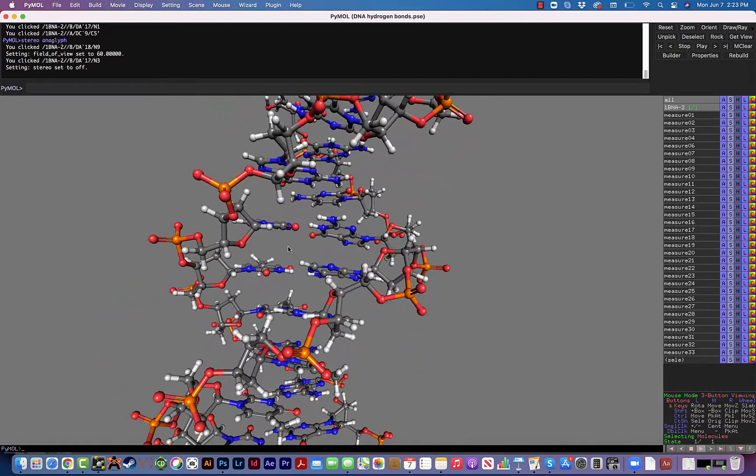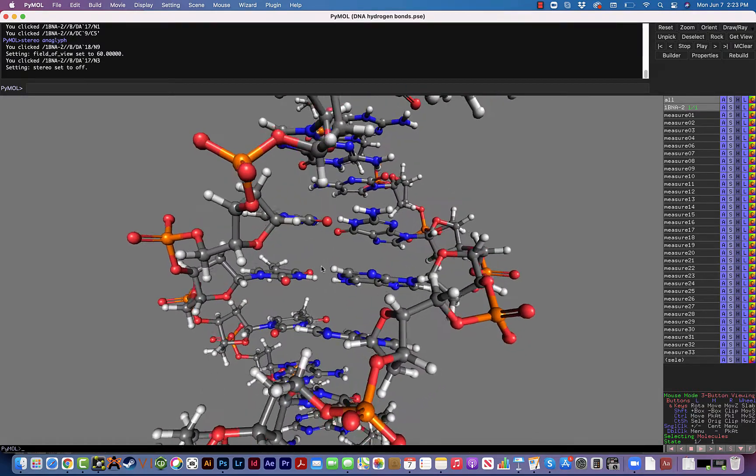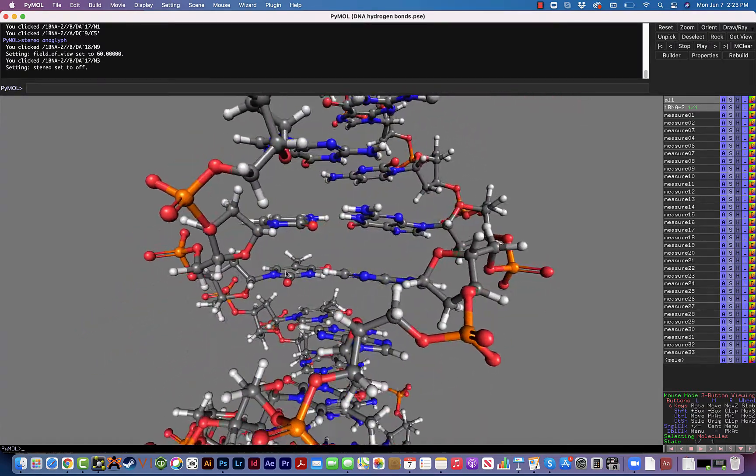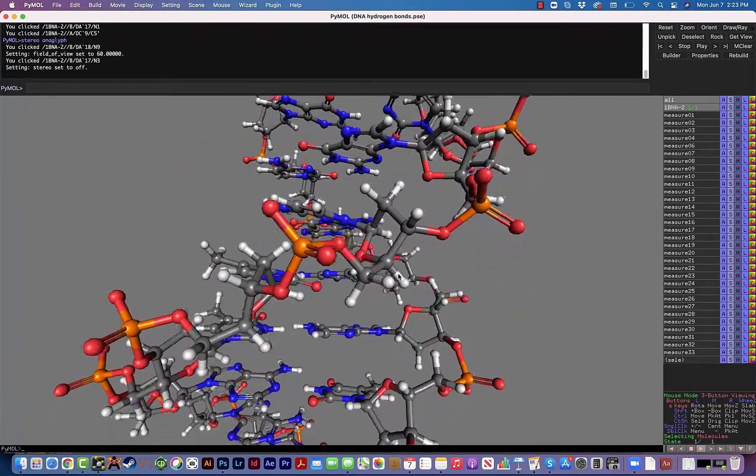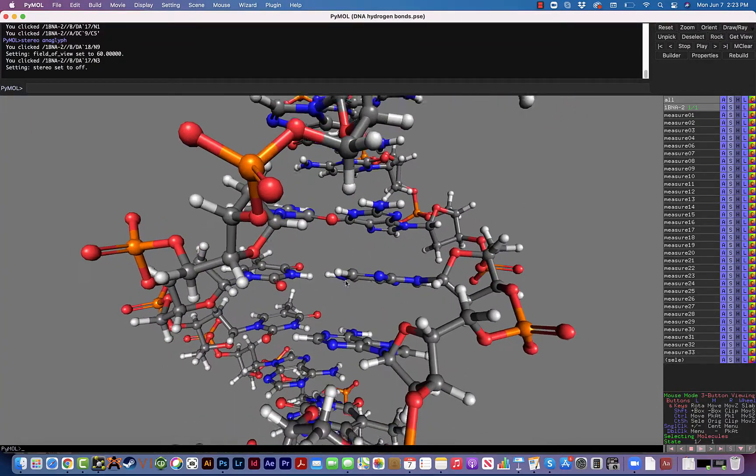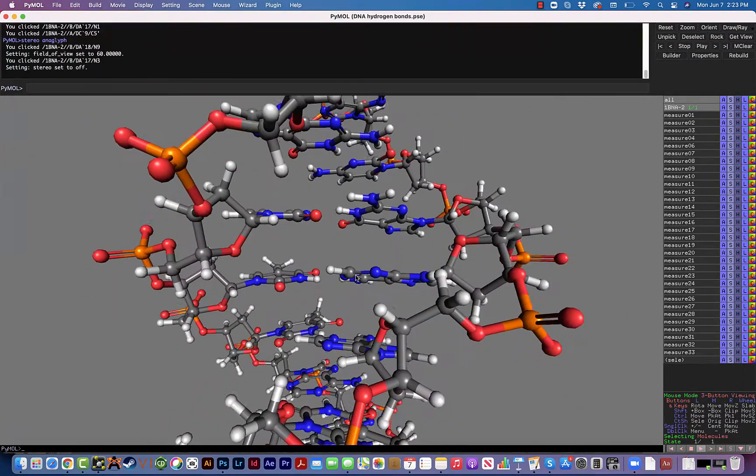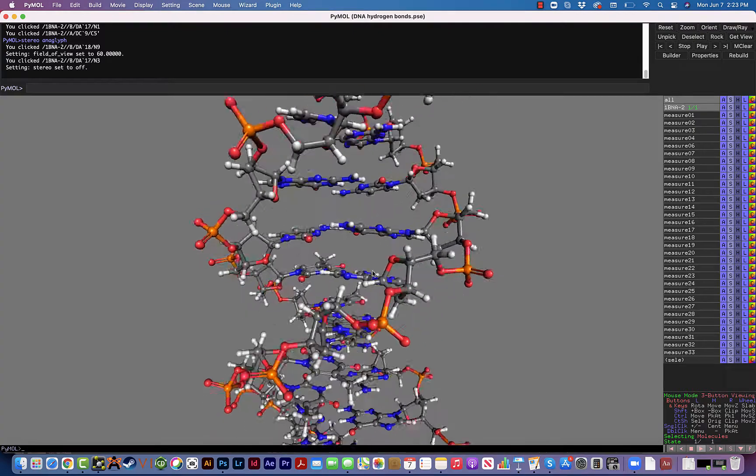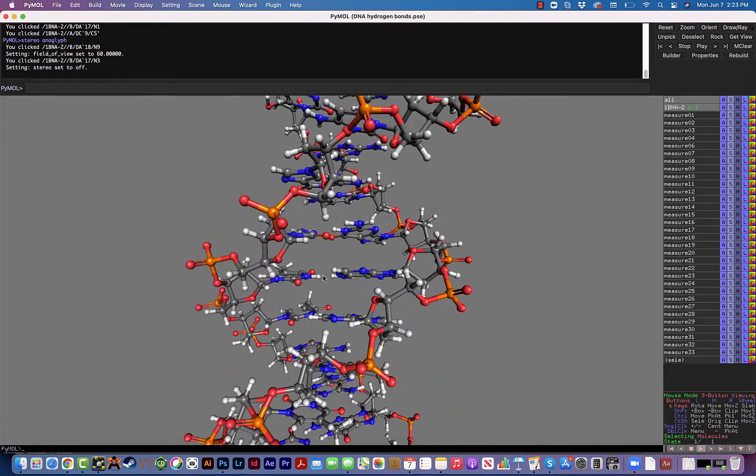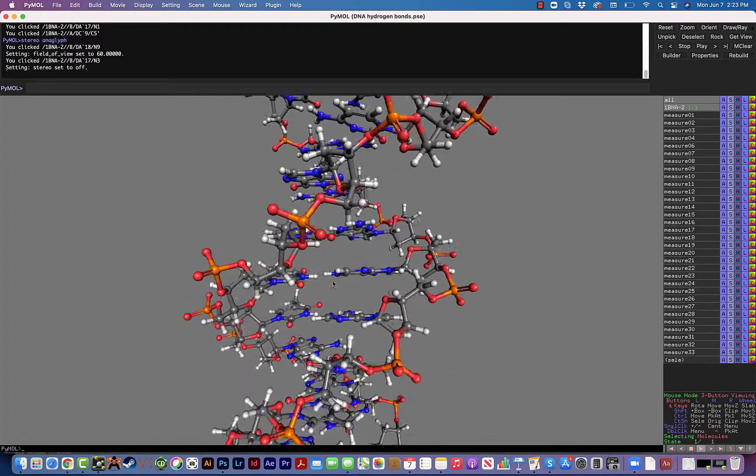For example, when I created the ribosome structures that you see later in the curriculum, I had to use the stereo view because it was just so big and complicated. It was very hard to look at it in the 2D way, so I was using the glasses to navigate that and highlight different things there.